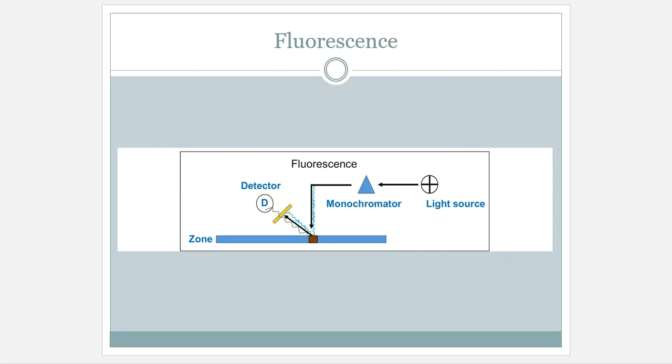Fluorescence is the same way. It operates by the same method in a densitometer read. The light source is going to cut on. You're going to choose the right light source. It's going to go through the monochromator. This picks out 1 nanometer of wavelength. That nanometer of wavelength is going to go on to a sample. Oh, look, there it is. I see it. And then what you're going to get is the original kind of light energy with extra, because it is now glow in the dark. So that extra is going to mean that the detector is going to be able to see it even easier than in absorbance readouts. And if that's something that your compound does, then that's great.